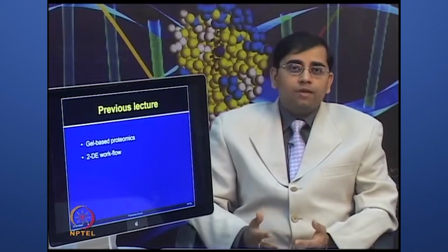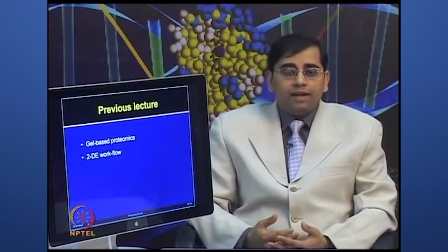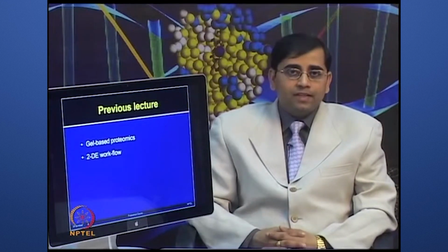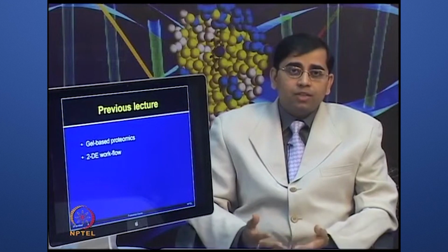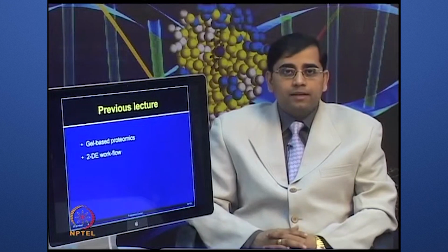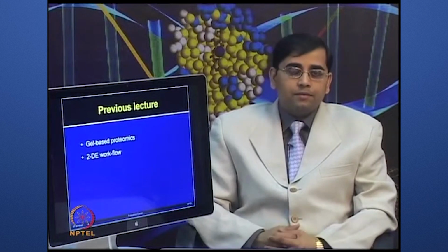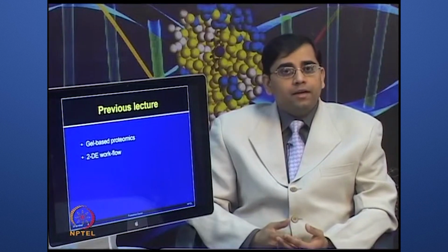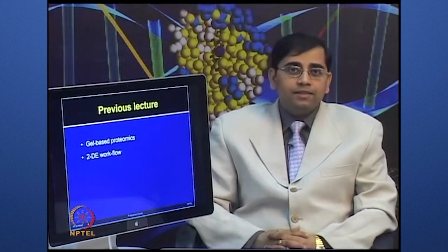Now, once you have performed all these steps and run the gel, you want to visualize your spots. So, you need various types of staining techniques. We discussed different staining methods which are available, and once you stain those gels, you can visualize those spots. You can see how many protein spots are visible on the gel, and then those spots can be further scanned for image processing. Now, good scanning, image processing, followed by data analysis to obtain meaningful information from these gels is very challenging.